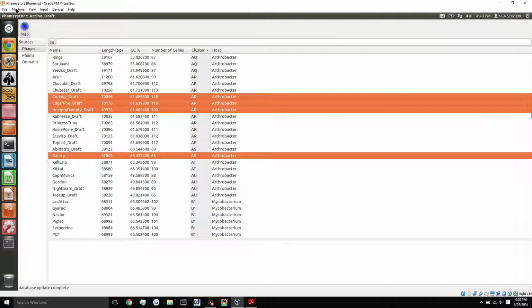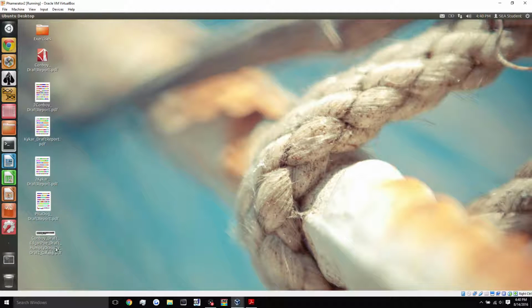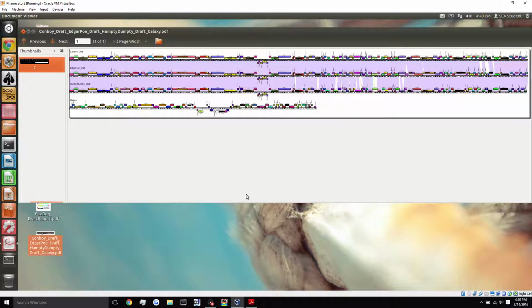So then when we go back to our desktop here, this is the desktop of the virtual machine, so we're going to have to get this to our regular computer desktop either by emailing it on the virtual machine to our actual machine, just emailing it to yourself and then downloading it, or something. There's probably an easier way, maybe a flash drive would do it, but this is pretty much what you would put on your poster. Maybe you would chop it in half to make it bigger, or cut out certain regions where you just want to stress some information.